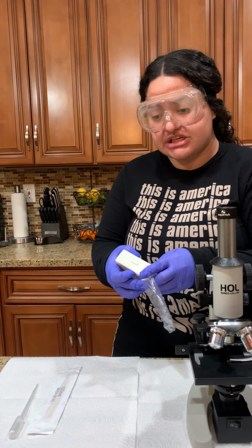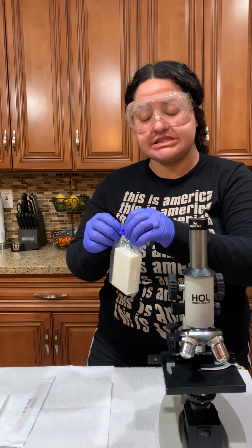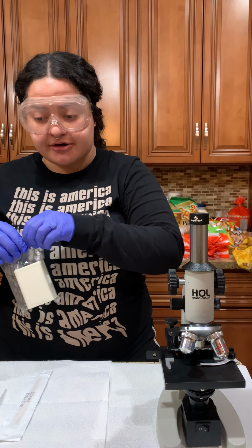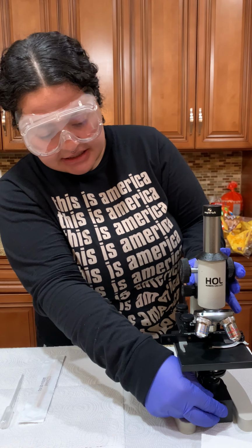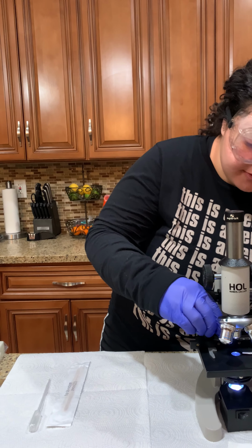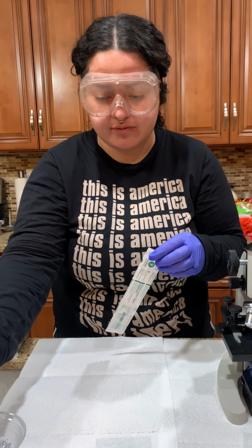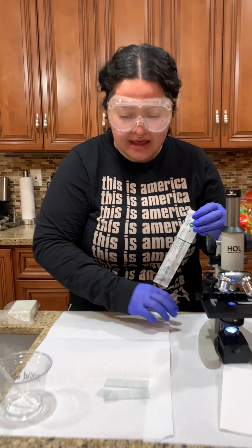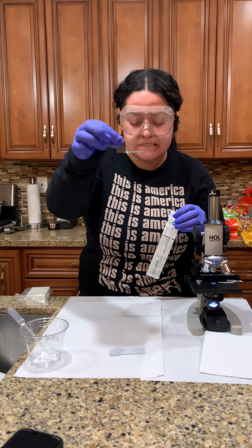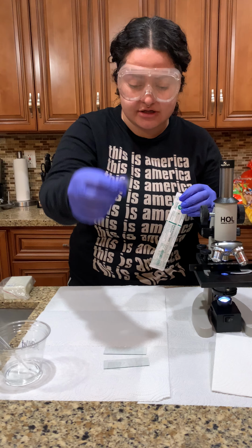And then the next exercise for this lab, they want me to get a wet mount of my cheek cells and my teeth plaque cells, and then I'm gonna observe them under the microscope. So I have my goggles and my gloves, and then I have this on already. So pretty much I'm gonna get a sterile swab. Here's my pipette. I'm gonna put in the distilled water I have right here. And then also on my work area, I have my actual slide, which I'm gonna be smearing my cheek cells to, and I have the little cover on top of it.